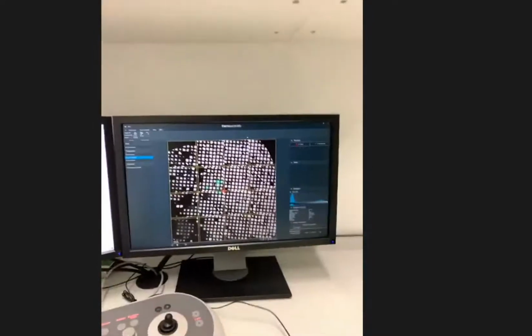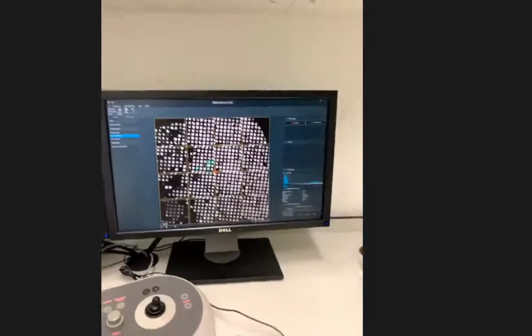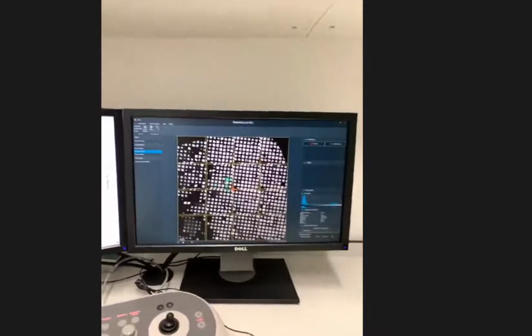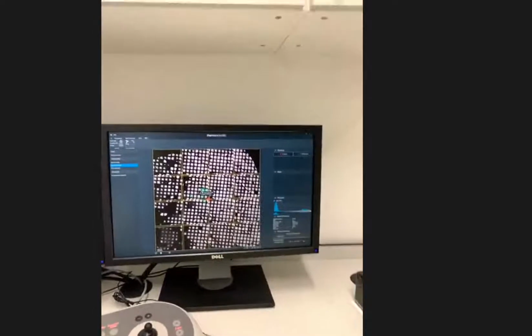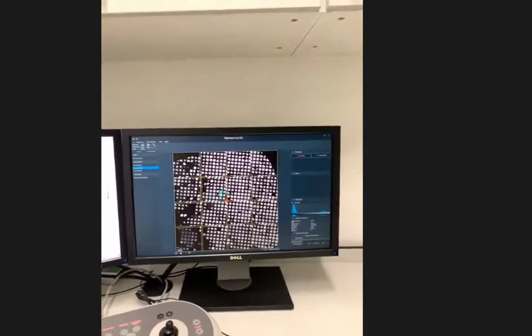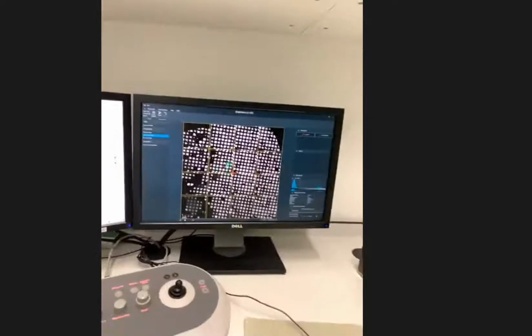You can see the spacing of the metal bars, and that has a carbon film with the protein on it. And you can see the little green dots where someone has selected the area that they want to collect. You can also perhaps see just how broken up it is, even with things that look like very bad samples. Sometimes you can still collect data.